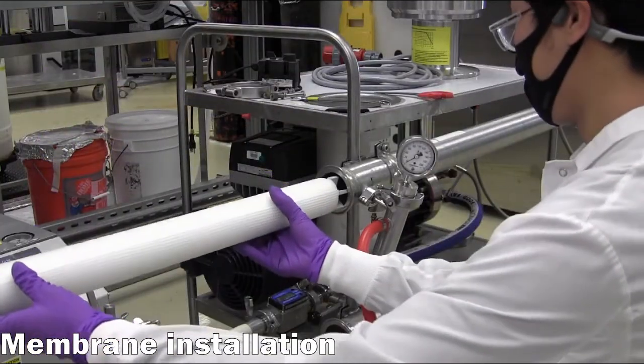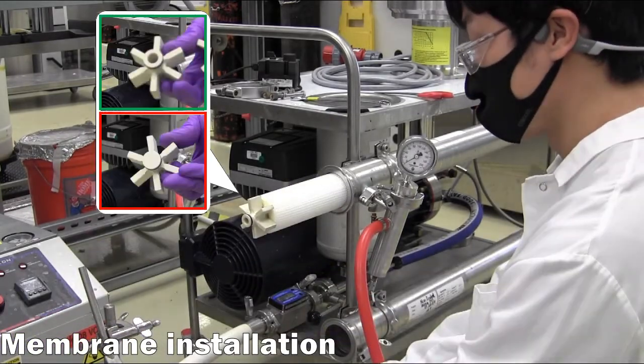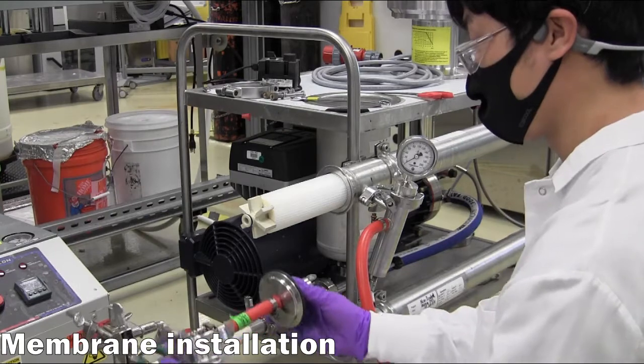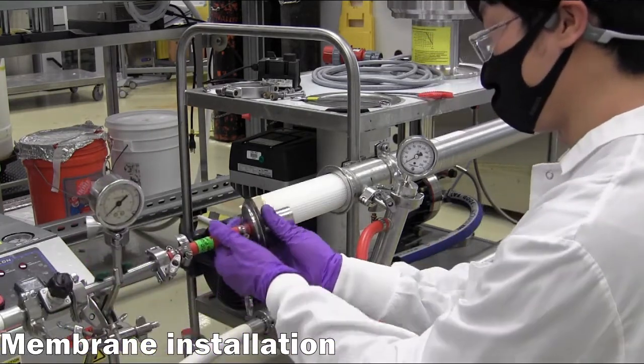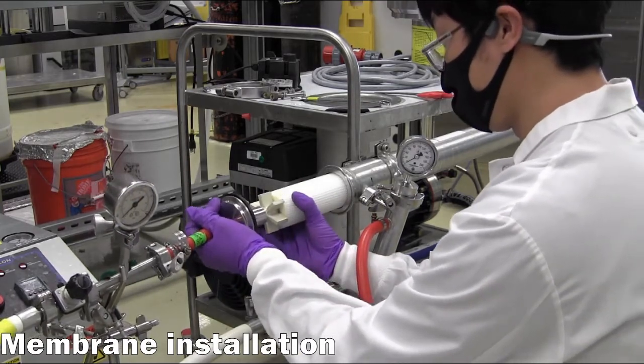The membrane is then inserted into the housing, with the blank ATD towards the inlet side, and the connecting ATD towards the outlet side close to the technician. Before fully inserting, the ATD is first connected to the end cap, facilitating the connection to the permeate outlet line.